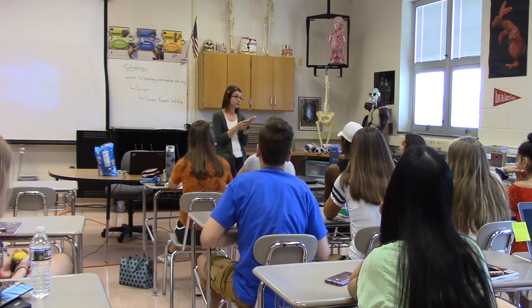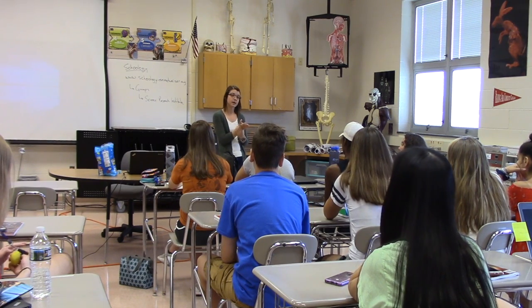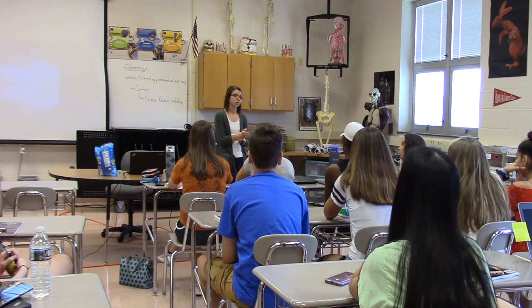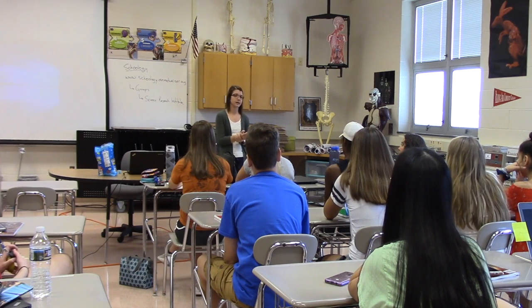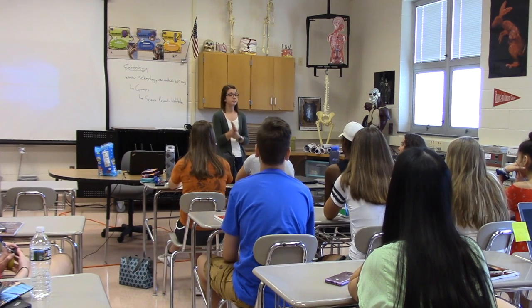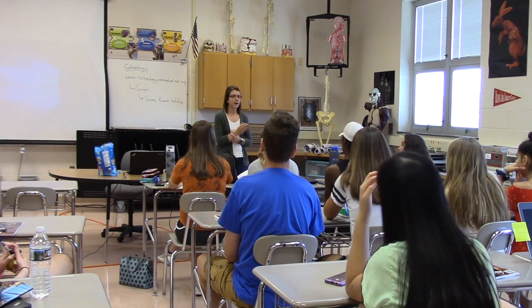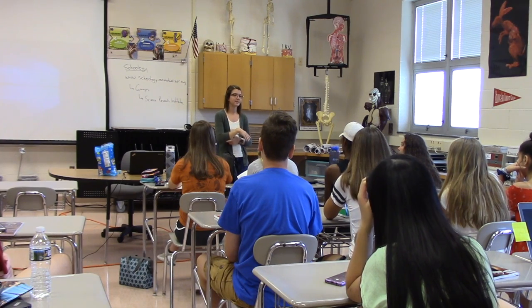So in your study, dilute that and then add that to your cells that are in your plate. Either you can do it the same day or you can do it the day after. It just depends on the assay. With us, I have some testing that I seed my plates the day before. I let them incubate overnight and grow up a little bit, and then I add directly to that plate. That's what you were thinking?